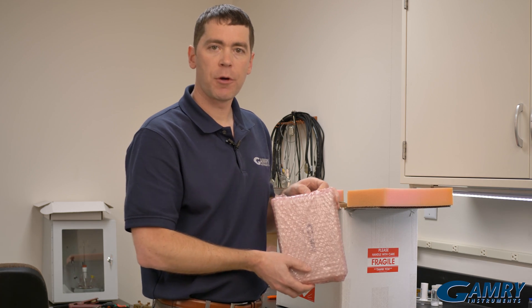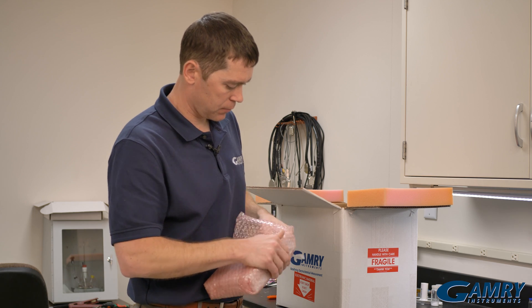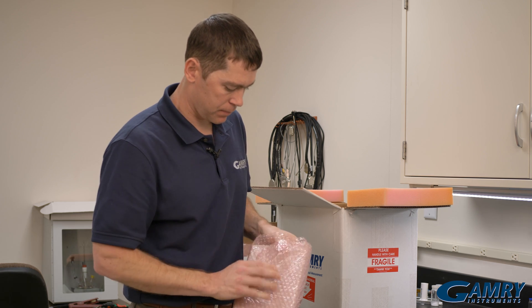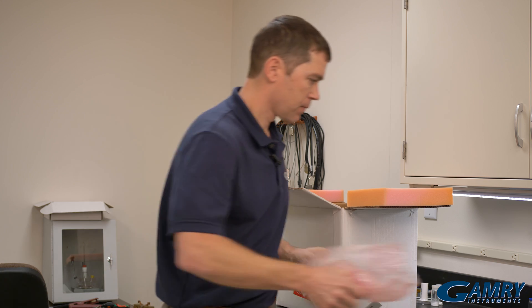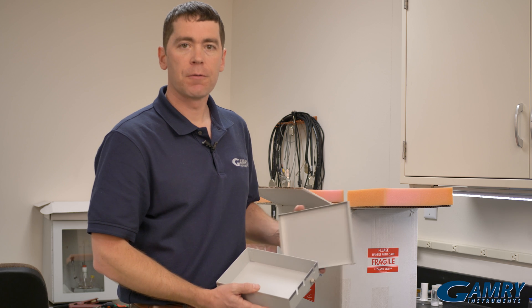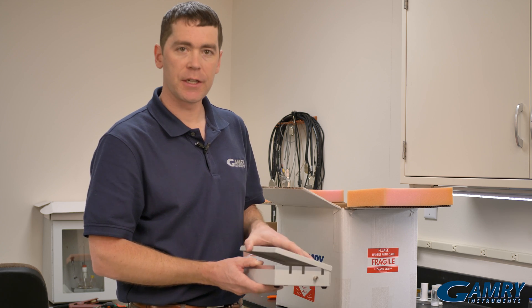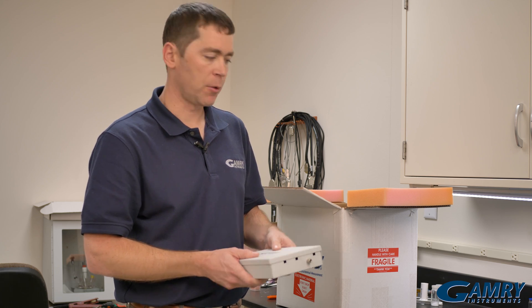Next we come across the calibration shield. This is what you'll actually place your calibration board in when you're running your calibration. You hook your leads up to your calibration board, stick it in here, and then you can run your calibration.